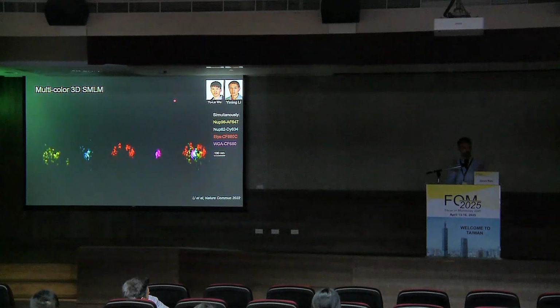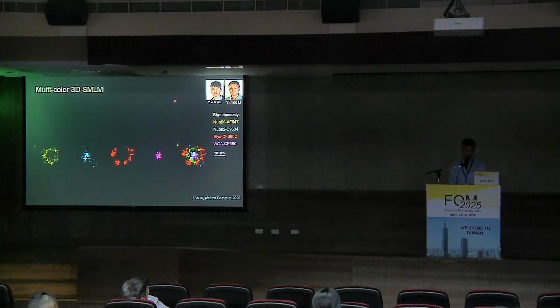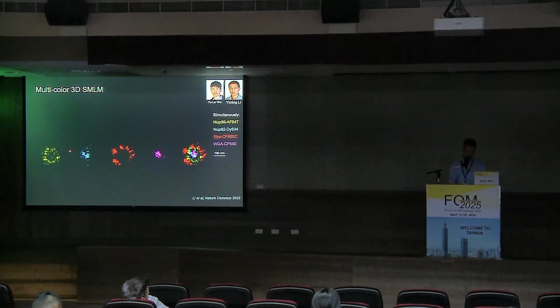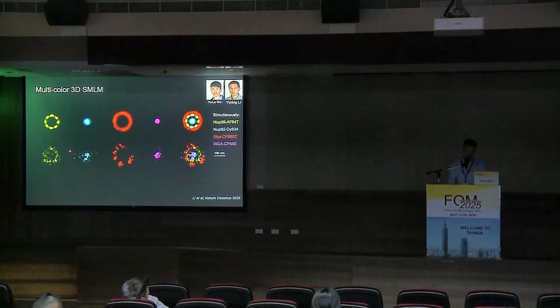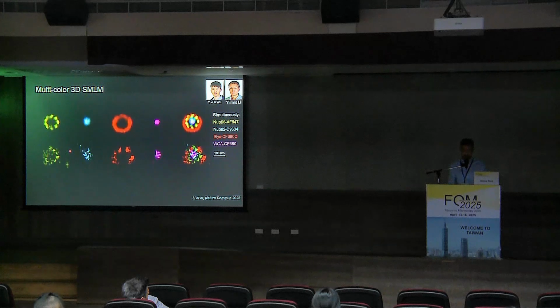Then we just have to look at the intensity ratio of the fluorophore in these 2 channels. And this is what we did here for 4 proteins in the nuclear pore complex. Down here you see one image acquired simultaneously in all 4 colors of a single nuclear pore, and up here an average that we calculated from, I think, 1,000 individual particles.